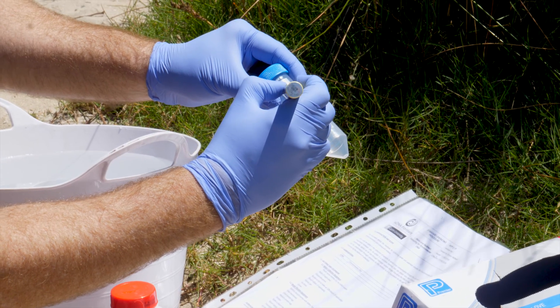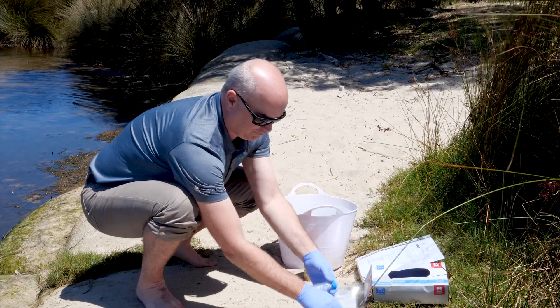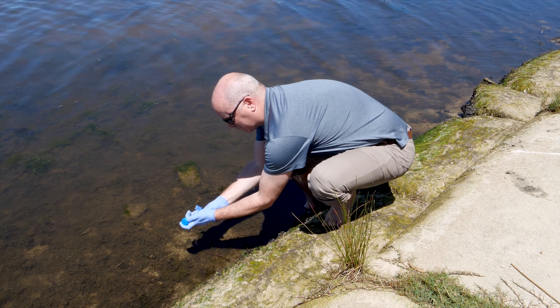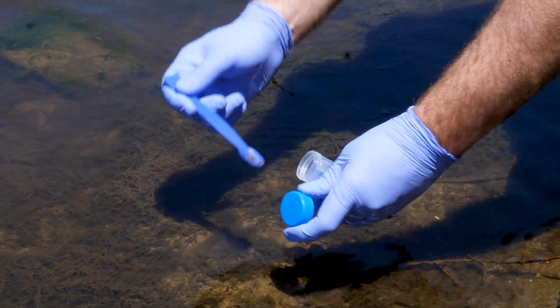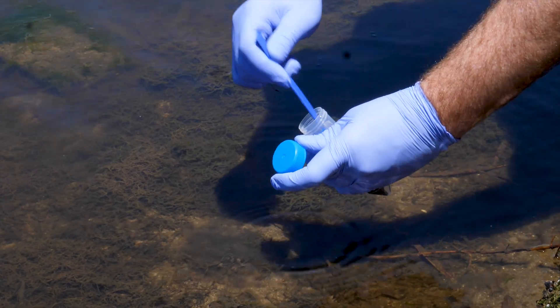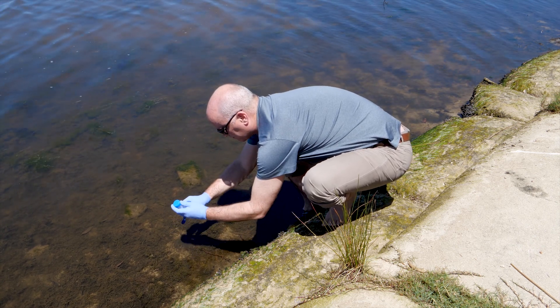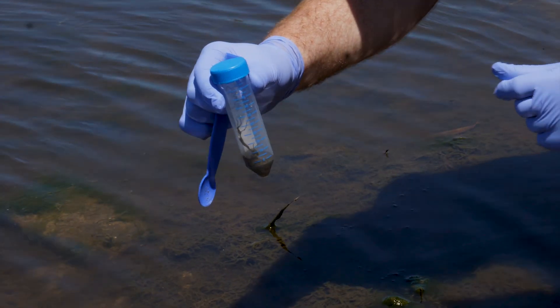Start by labelling your tube, noting the site name, replicate number, and date of collection. To sample, take your labelled tube and a clean spatula. Enter the site and, again working upstream of the water flow from where you are, spoon the sediment into your tube. The amount of material needed is relatively small — filling the tube to approximately half full or less is fine, as we can pulverise the whole sample and then sub-sample from it for analysis. The tubes provided have been specifically chosen as they are durable enough to withstand the metal ball bearings used in extraction, allowing direct pulverisation of your sample.